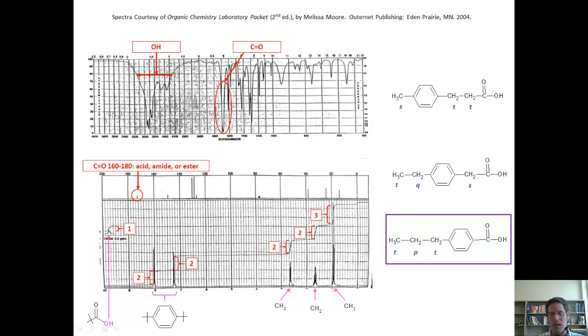I also have for my integration, three different signals in single bond land, 2 to 2 to 3, consistent of being a CH2, CH2 and CH3. The splitting tells me that none of these are singlets, so none of them can be isolated by itself as in these two guesses here. Thus they must all be in a straight chain. Is my answer consistent with all of the data? Absolutely yes. Is my answer correct? Yes it is.